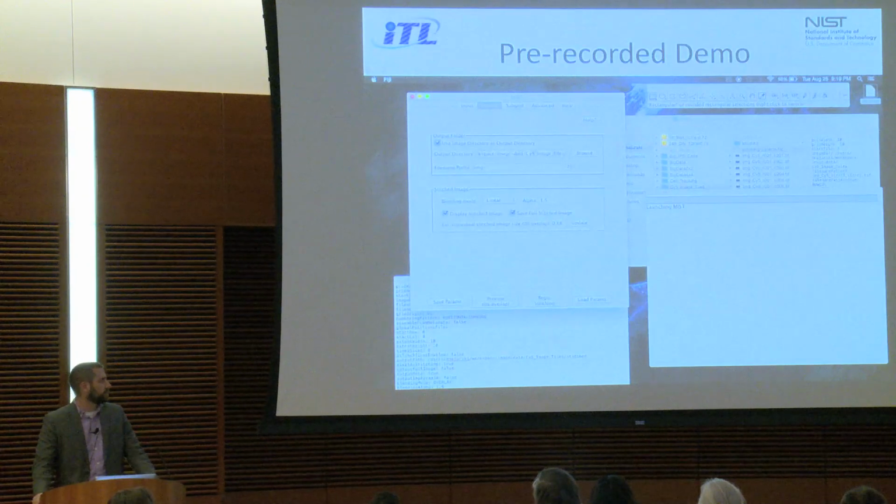Next, you're going to check your output settings. Where are you going to save the output image? Generally, I like to stuff it in a subfolder of where the input tiles are to keep everything contained. You can rename the output prefix. It gets appended to every file MIST will generate. You can adjust the overlay blending between the images, and you can display the image or you can save the image, and those toggle both.